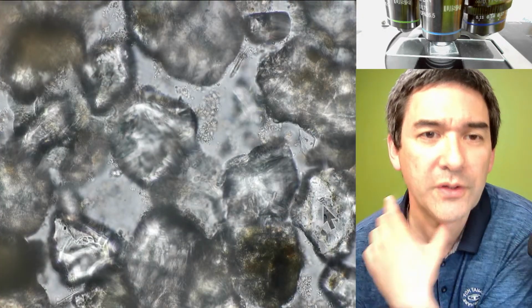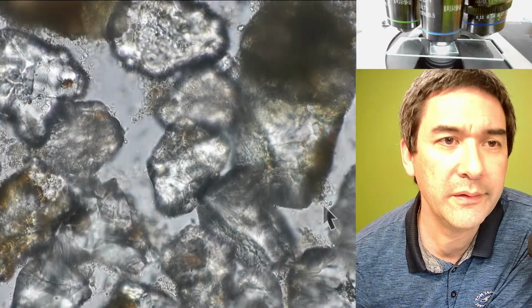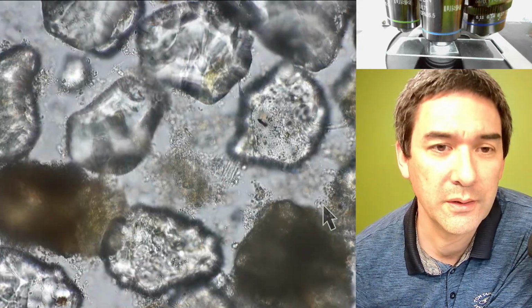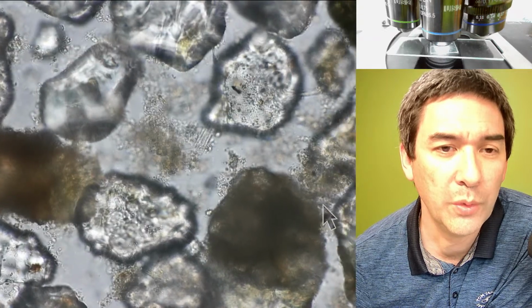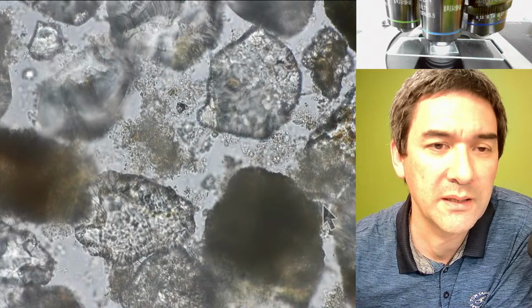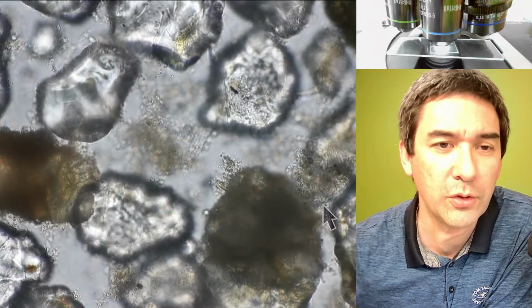But usually, if you find one place where there's movement going on, then statistically, there should be others as well. Here we are again. But I don't know what this could be. I know that there are sometimes diatoms around that move. Oh, it's a diatom.